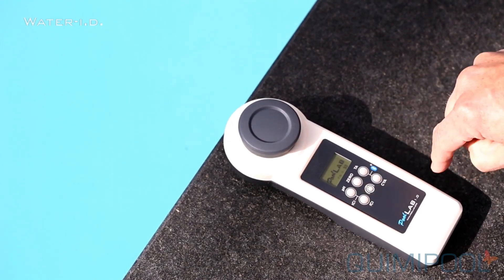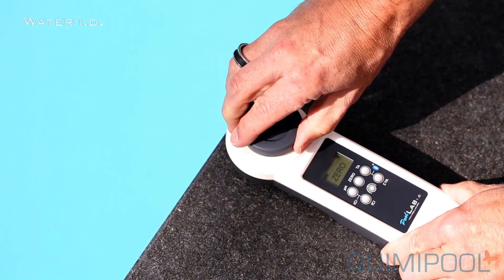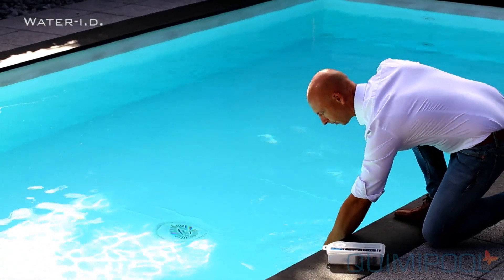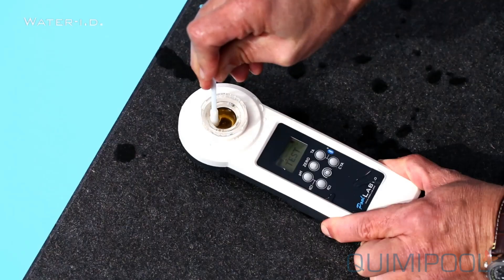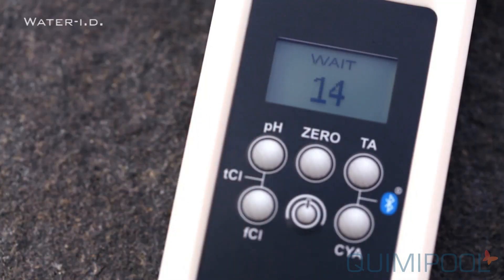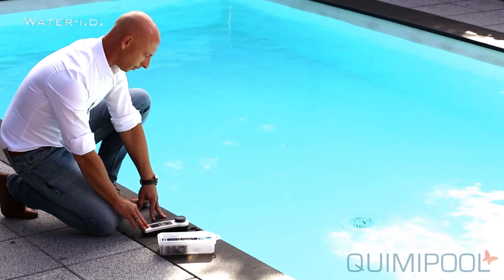Using the PoolLab is as easy as that. Just immerse the waterproof PoolLab into your pool to scoop 10 milliliters of water. Add a reacting reagent and press the button for the parameter you wish to test. The result will be displayed on the PoolLab screen.